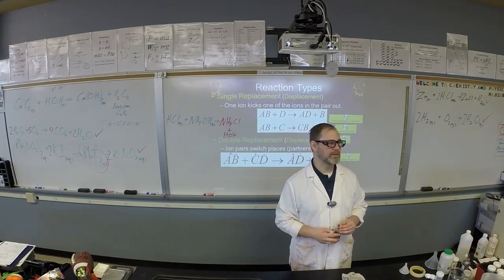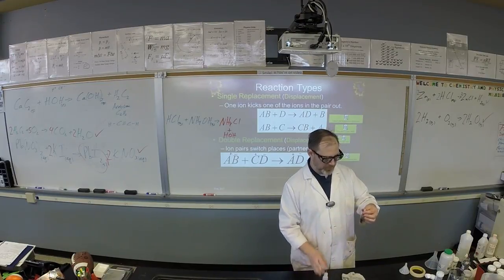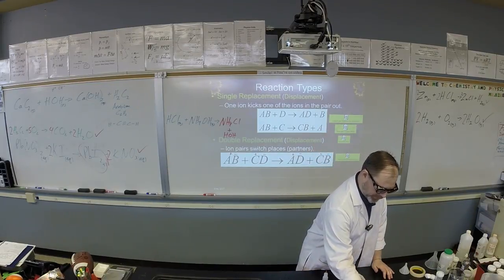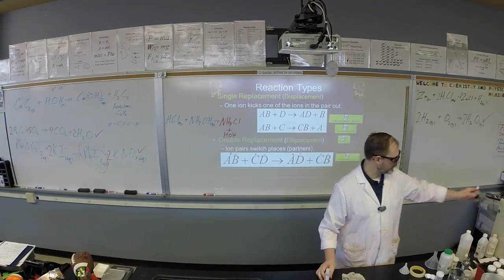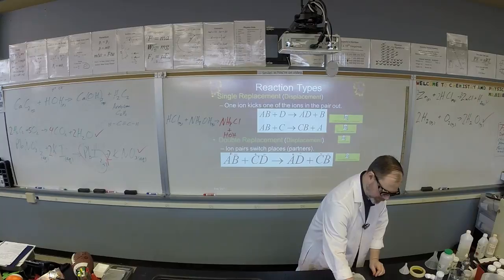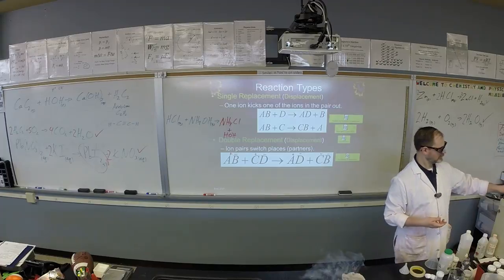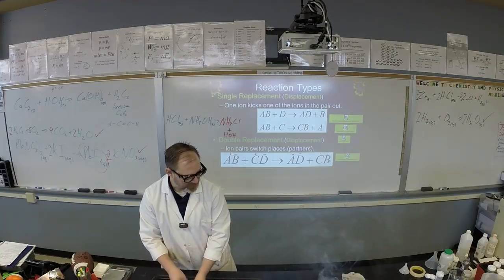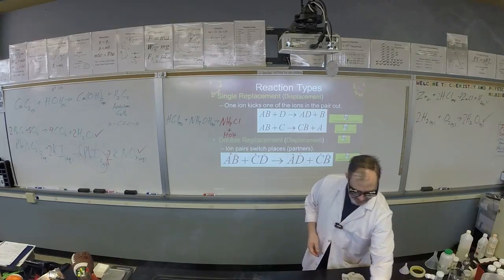I made a bunch of smoke and it didn't actually set the fire alarm off, so you'll be fine. So here is concentrated hydrochloric acid. I'm gonna make a little smiley face. Whoop, there's my concentrated hydrochloric acid. This is my smiley face of concentrated hydrochloric acid, and I'm gonna make 2 eyes of ammonium hydroxide. So what's happening is the ammonium hydroxide and the hydrochloric acid are reacting. And then off it goes.